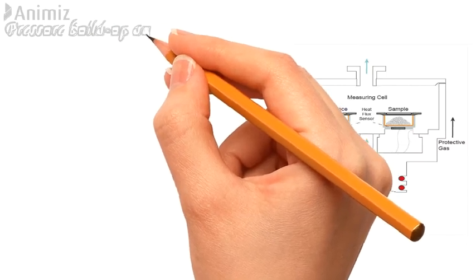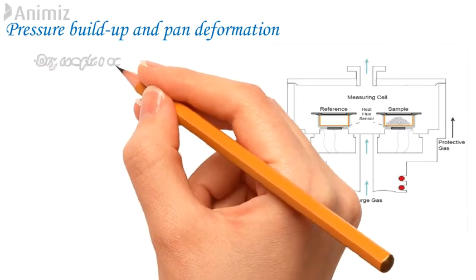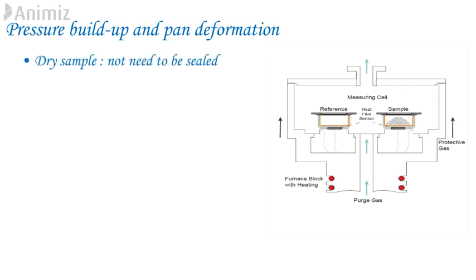3. Pressure build-up and pan deformation. Pressure build-up in an inappropriately chosen pan is a frequent cause of difficulties. It is important to determine whether a sample needs to run in a hermetically sealed pan or not. Dry samples unlikely to evolve significant amounts of volatiles below decomposition do not need to be sealed. Yet if run in hermetically sealed pan then pressure will build up inside the pan as it is heated. Many hermetically sealed aluminum pans cannot withstand high internal pressure and will deform.